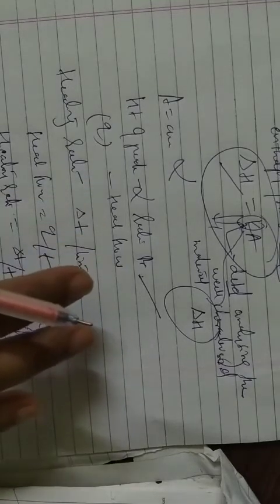So this is about the DSC, and today we go for the closing, the final part of this DSC, so we can go for some advantages. It is a more popular technique because of its speed, simplicity and availability.